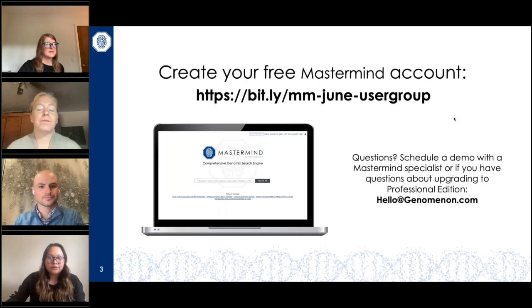Now, the other one that you can search by, and I think the answer was covered in a roundabout way, so we can just sum it here, is can I search by genomic coordinate for any change? The answer is yes. What you can do is insert a singular genomic coordinate change, and as Denise showed you, you can search that table.